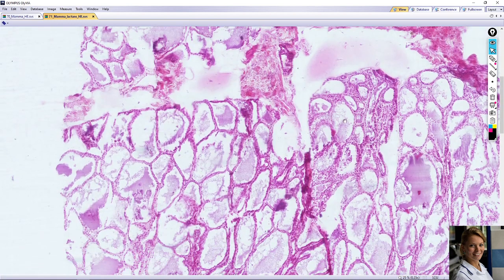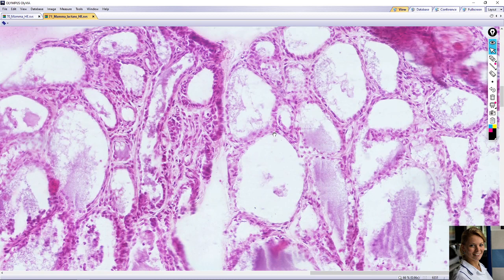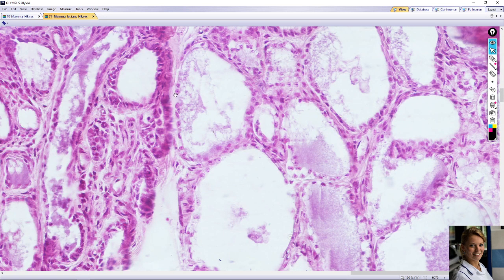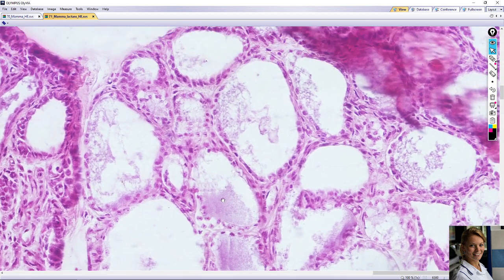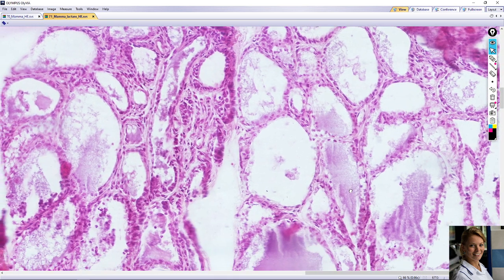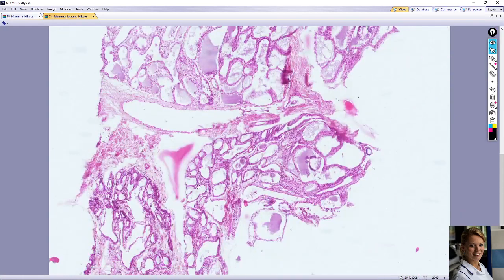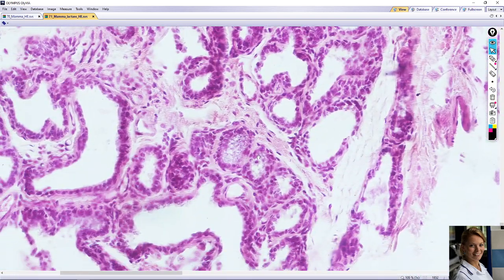The active alveoli are filled with secretions with milk and lined with cuboidal cells. You can see nuclei with nucleoli, for example here — nice visible low epithelium, cuboidal cells. Some alveoli accumulate secretory product in their cytoplasm and their apices appear vacuolate or light staining, for example here and here.